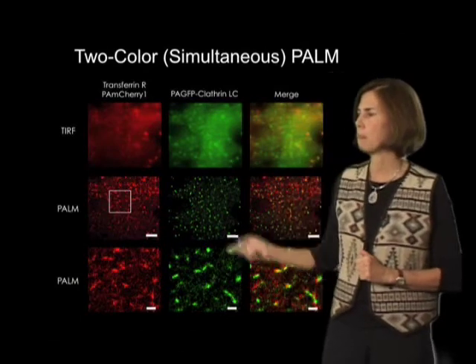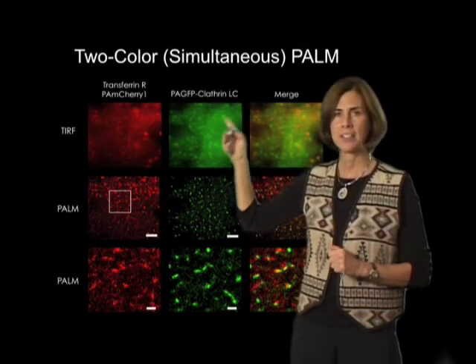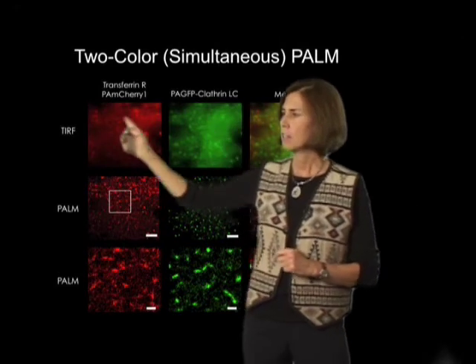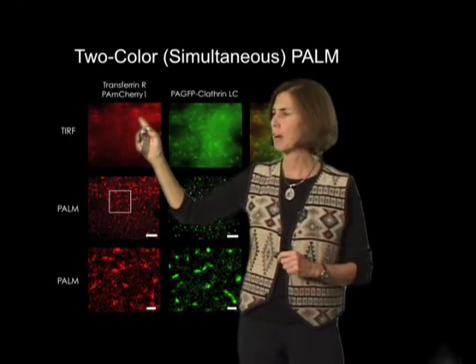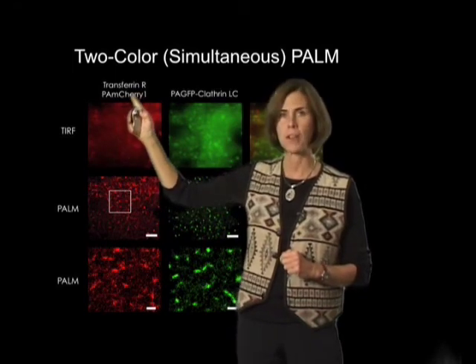And here's an example where the photoactivatable GFP tagged to clathrin is being expressed with a photoactivatable M-cherry tagged to transferrin receptor.